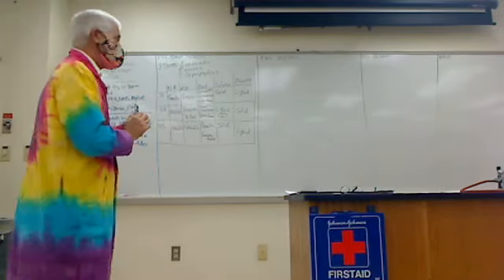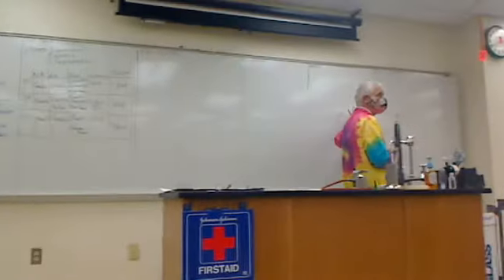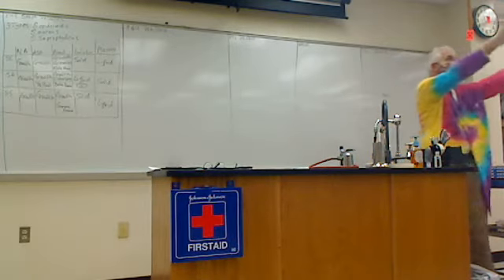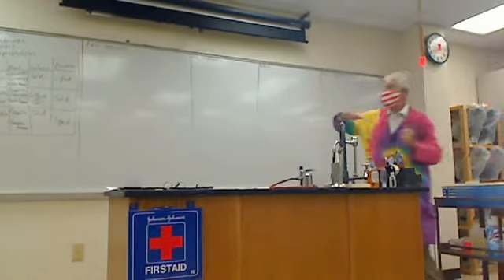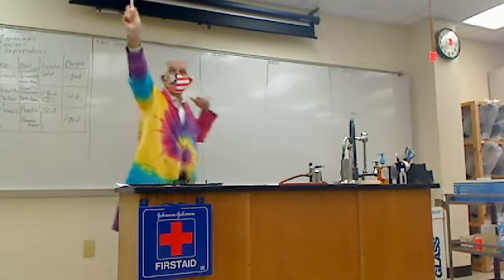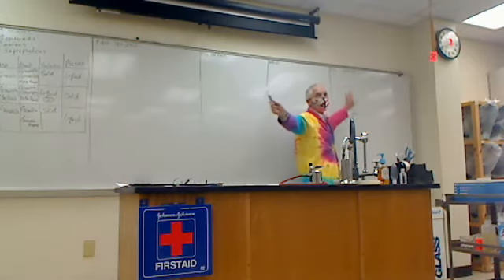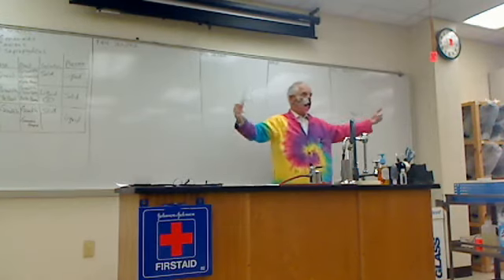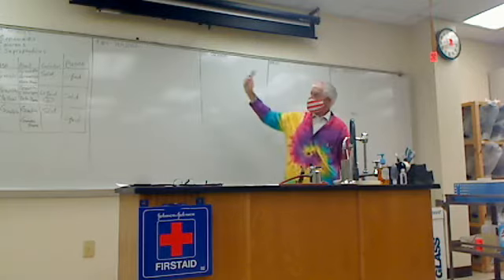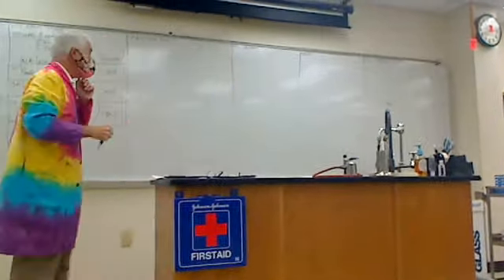Excellent. Okay, so today we're going to set this up, and I've decided to have mercy on you today. I'm going to have this side of the room set up the plates for the PEA and EMB. And I'm going to have you guys on this side inoculate these tubes here. Sound good? And then we'll take a look at what these results are next time. So let's go back to page 44. I want to explain a couple of things with the PEA and EMB.